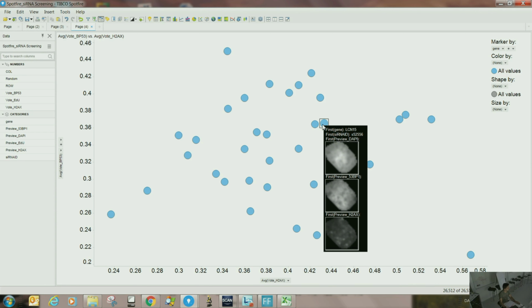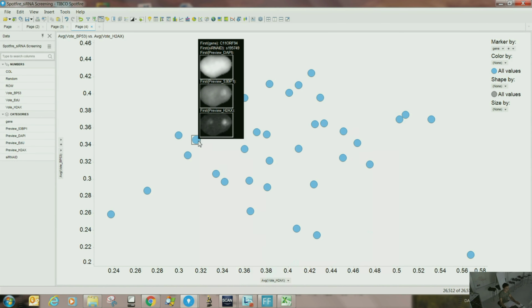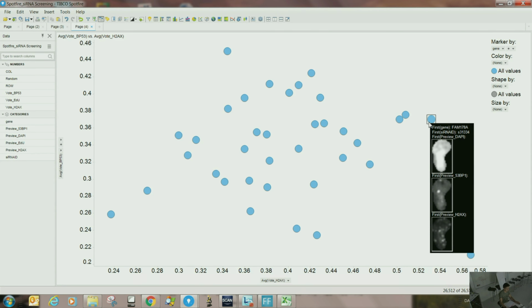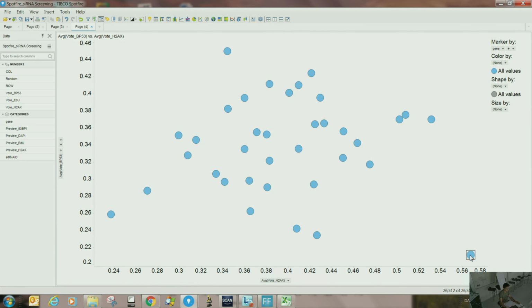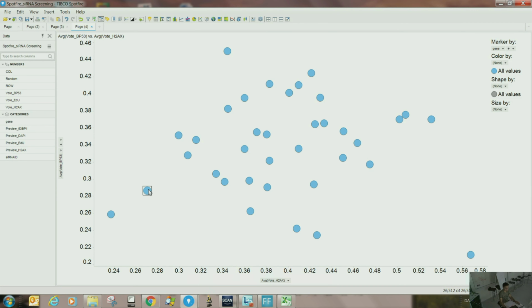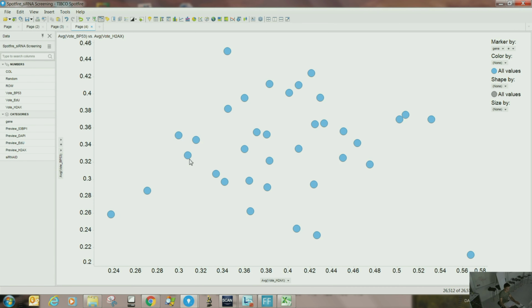See here? You know what's happening actually here. There's a representative class. Okay. I can imagine why the 53BP1 is more here. You see here? And gamma H2AX, because you can see from the image itself. Of course, it's less here. It's also, that's a DAPI basically. That's a false positive. Okay, so there are so many things you can do.